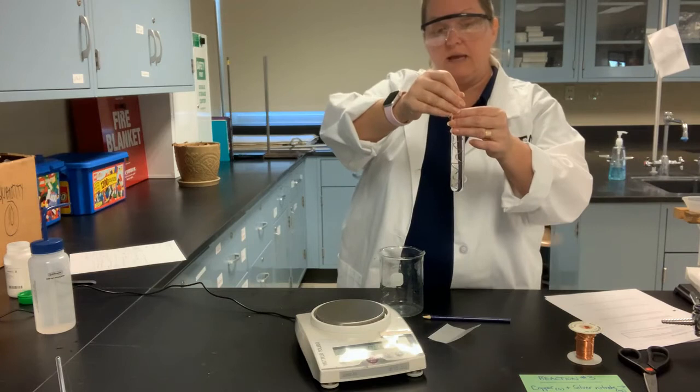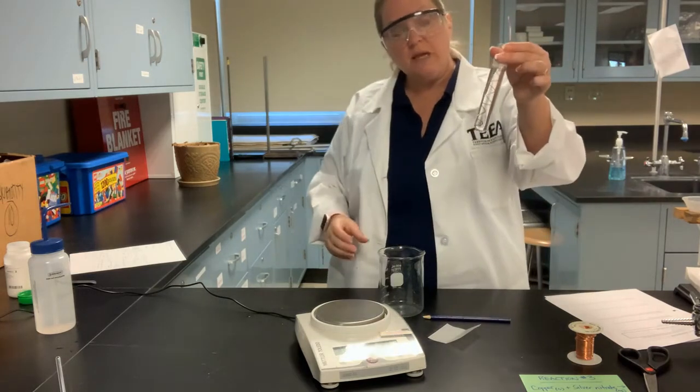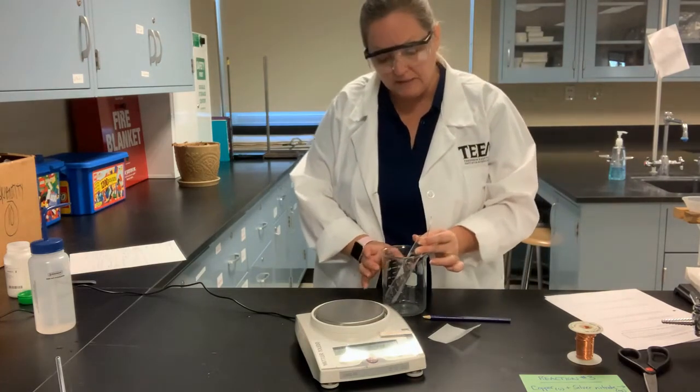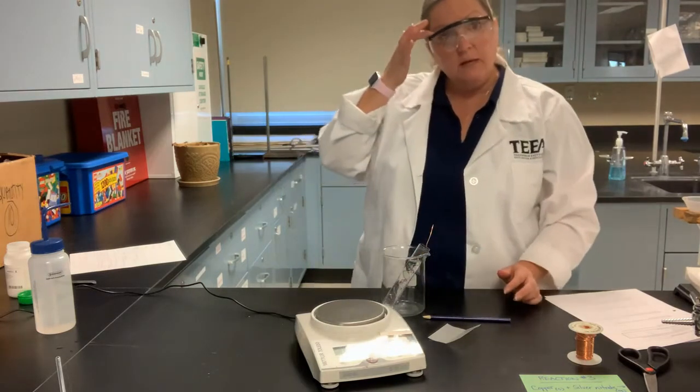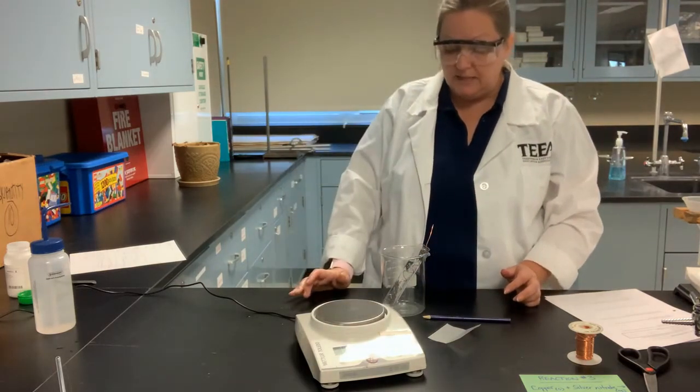And now I'm going to add my copper coil. And then I'm simply going to place it back into the beaker and let it set for a 24-hour period in order to allow the reaction to take place.